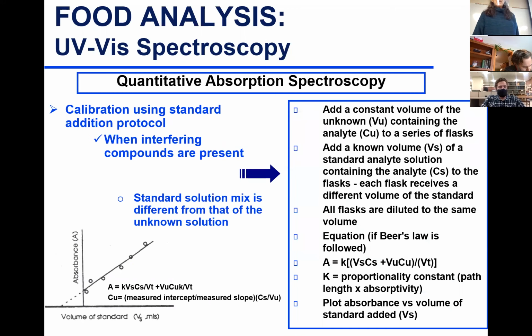The last thing here that is a little bit complicated is the standard addition method, which is when you have a very complex sample matrix that you cannot recreate in your standards. So a lot of interfering substances, just a complex matrix for your sample, that you cannot prepare your standard in the same way. So you build a standard curve within your sample matrix, and we call this standard addition. This is very common and actually used a lot because most of your sample matrices are complex, and it's very, very hard to have standards prepared in the same way to get accurate results.